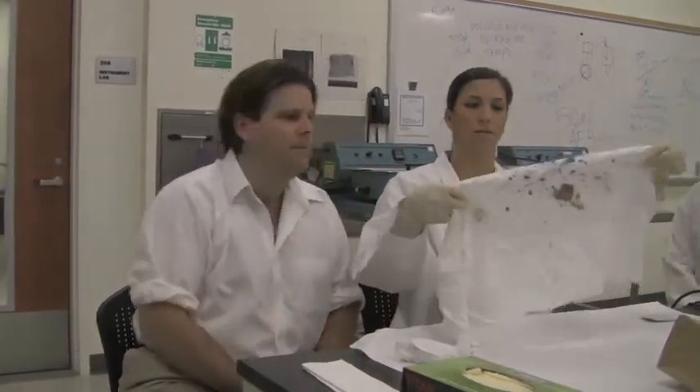We have our evidence sample here. It's a little messy, but we have what we think are blood stains. At this point, we do not know — we would just report it as a reddish brown dry stain on a cloth.